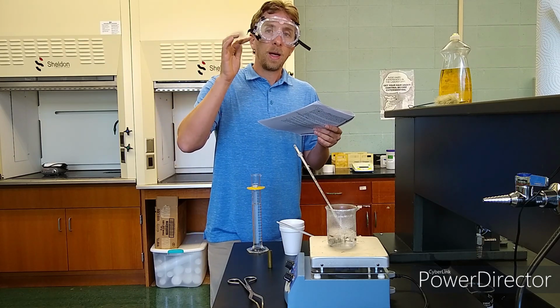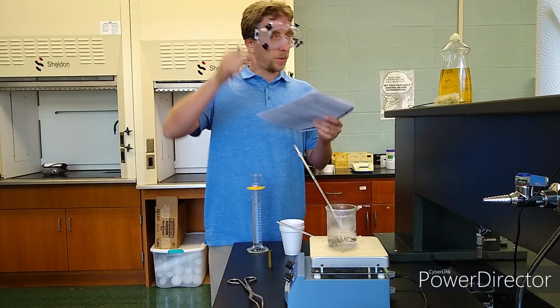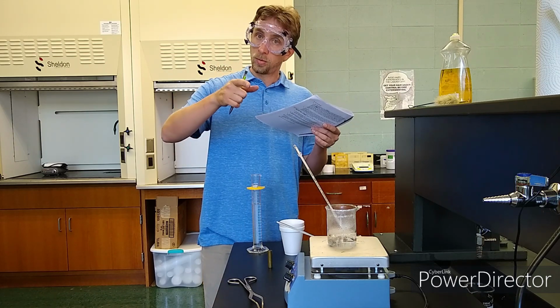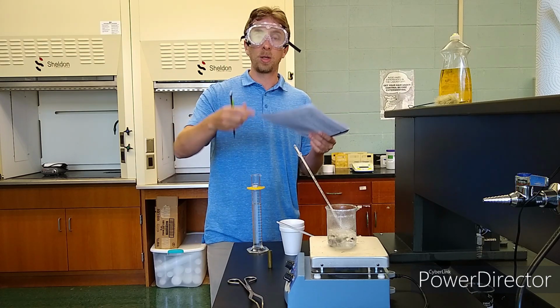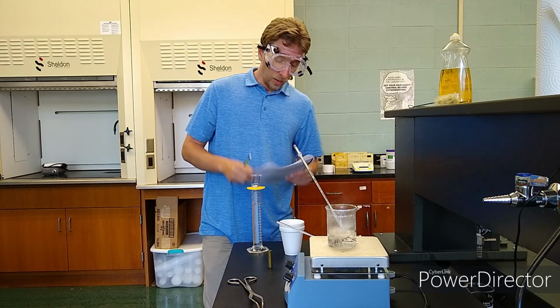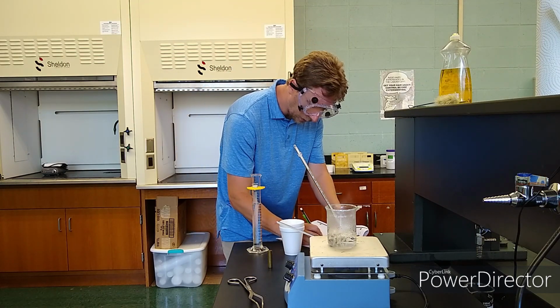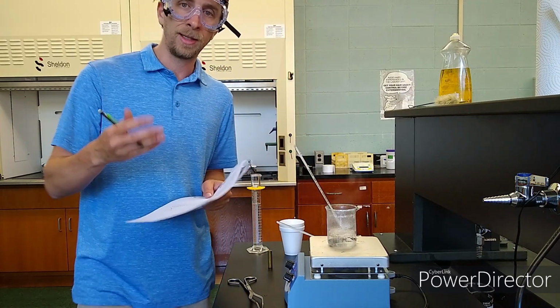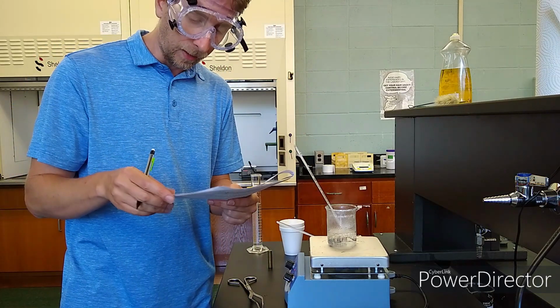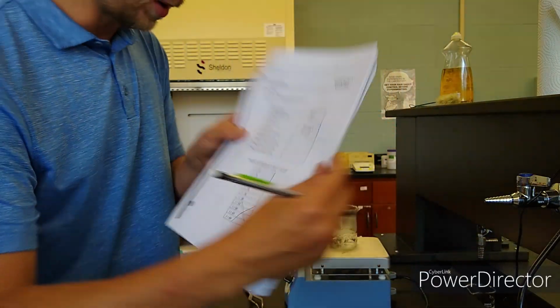That 1 milliliter of water equals 1 gram of water. So 79.6 milliliters of water equals 79.6 grams of water. You don't need to measure it on the scale. But people always get that mixed up sometimes. It's just one of those things that drives me bonkers, because that means they obviously didn't understand the density lab that we just did last week. So 79.6 grams of water.